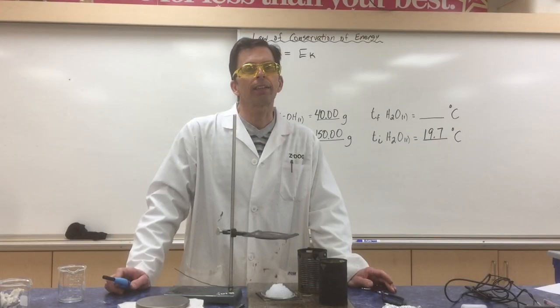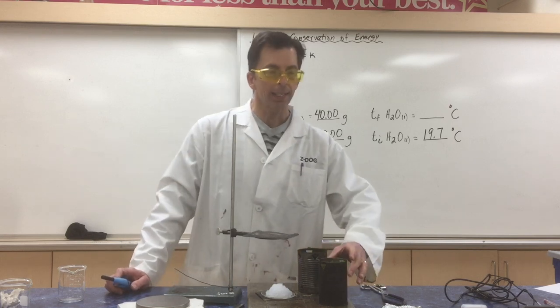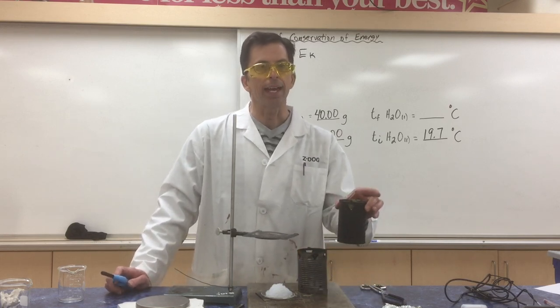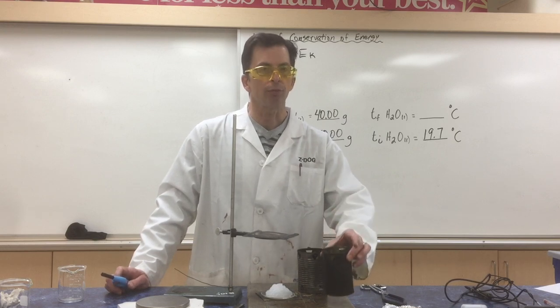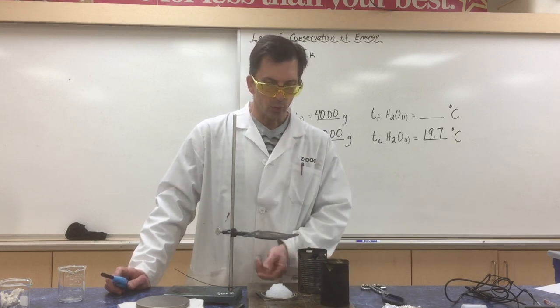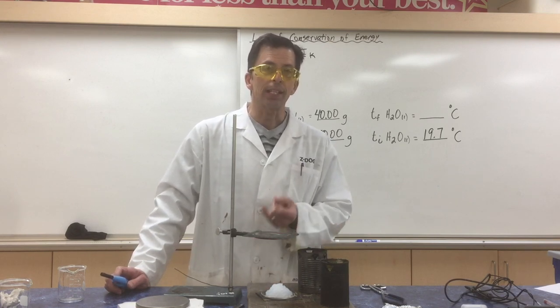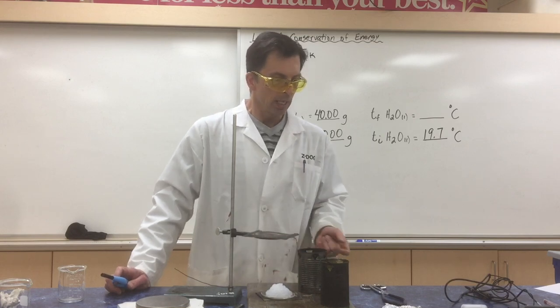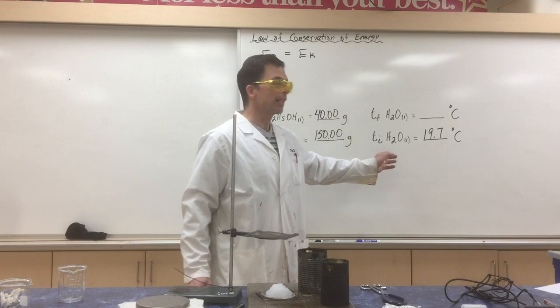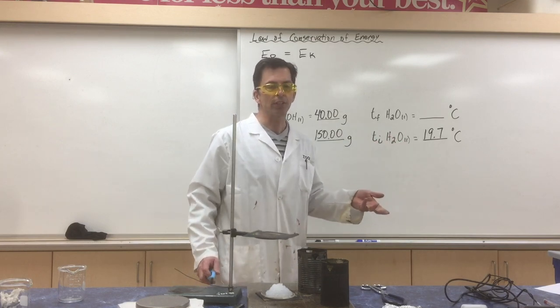We're now set to collect the data for the experiment. In the calorimeter — the top metal can — I've poured 150.00 grams of water. Remember we have 40 grams of ethanol in our calcium acetate, water, and ethanol substrate or fuel. I have measured the initial temperature of the water to be 19.7 degrees Celsius.